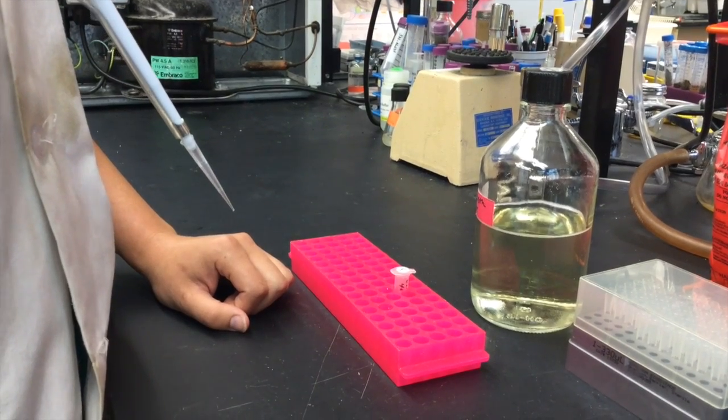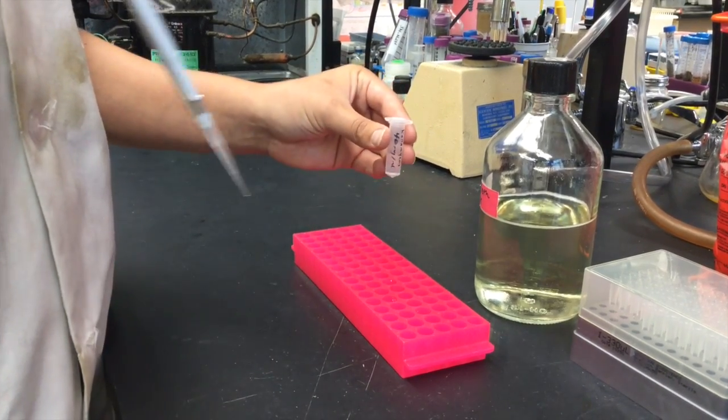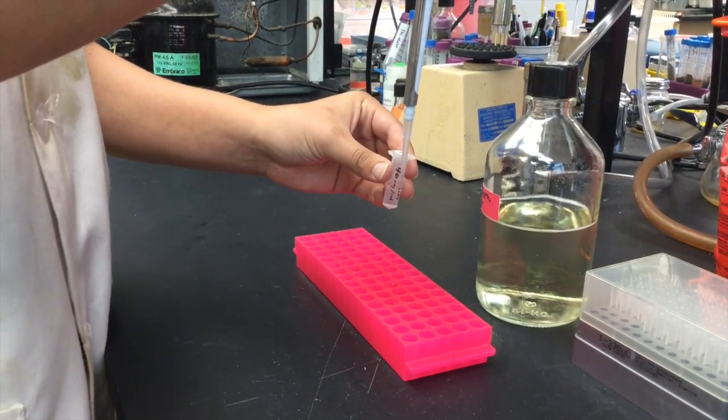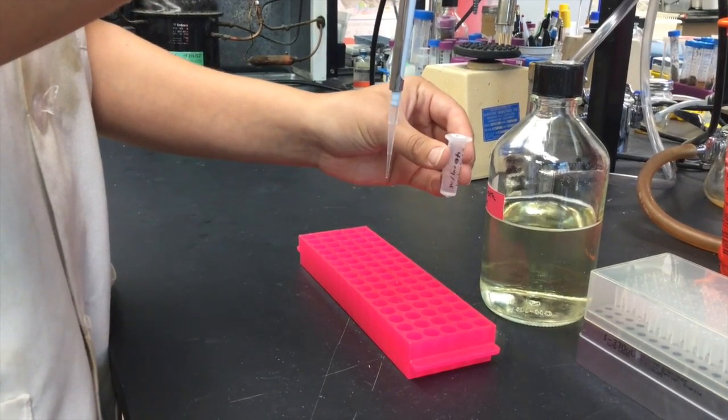Now draw up 150 microliters of the antibiotic solution. Hold the pipetter straight up and down, not at an angle. The antibiotic solution is sterile, so be careful to use good aseptic technique.